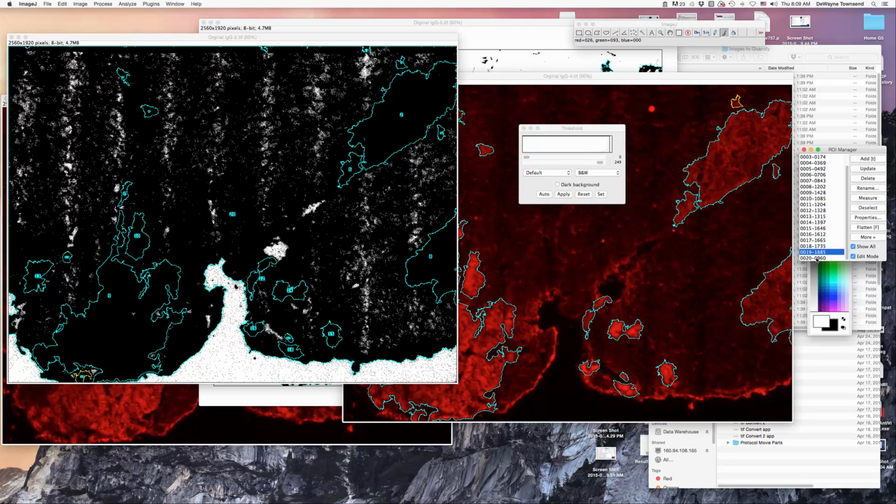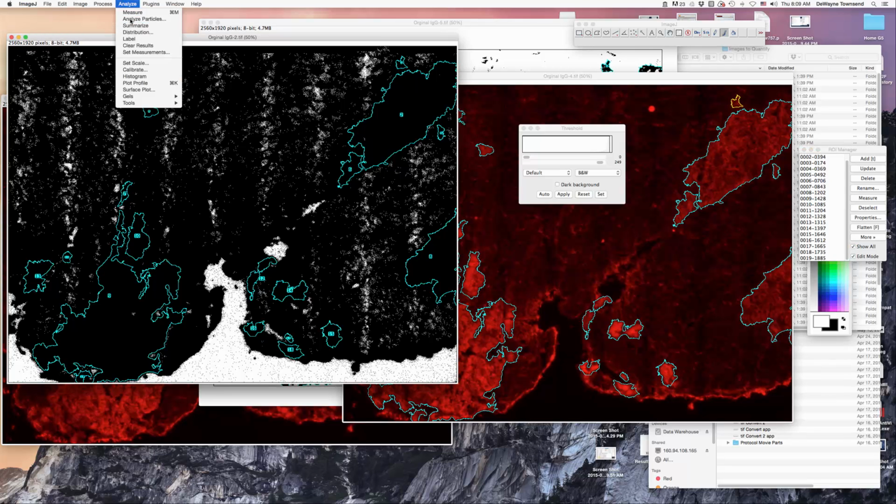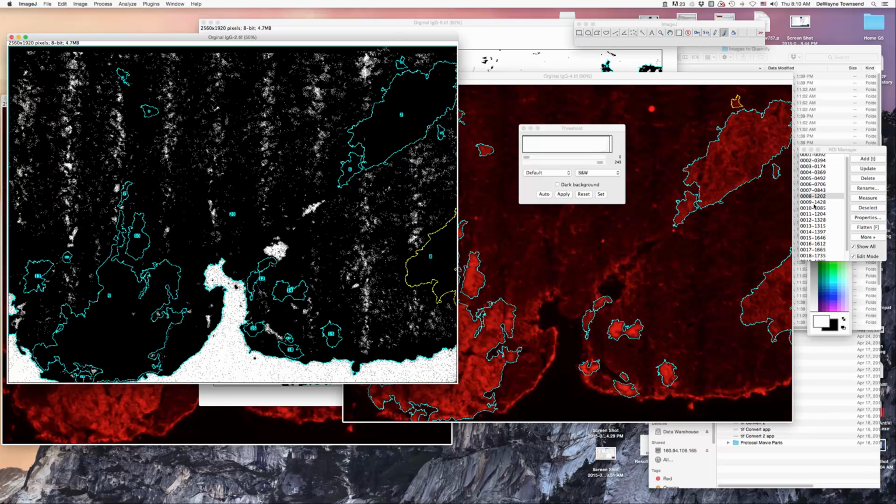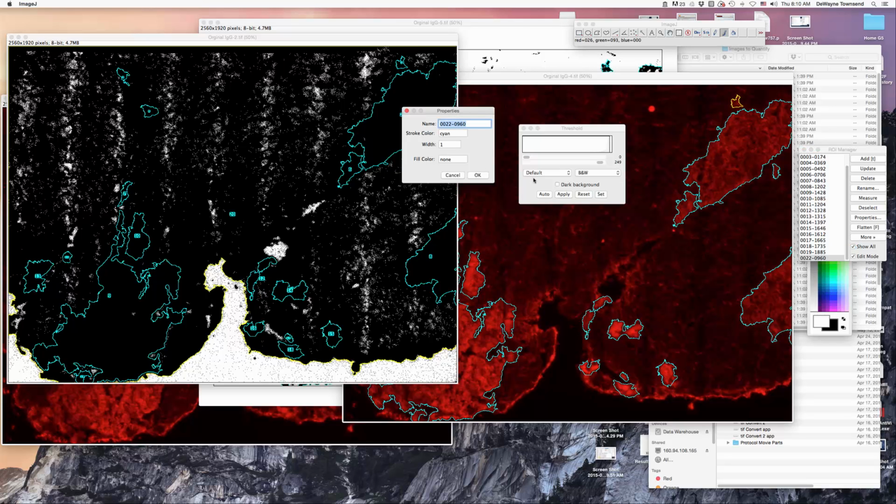All right, so then let's go here. I'm going to take this number 20. I'm going to delete it because we're about to replace it. I select this image, analyze particles, run it again. Okay, and hopefully we just have one more. So now it's labeled 22, but you can see it labels the entire outside of the cell. So that's good.